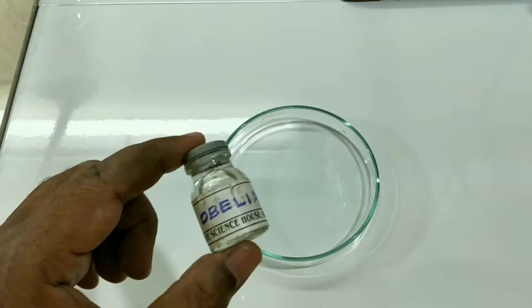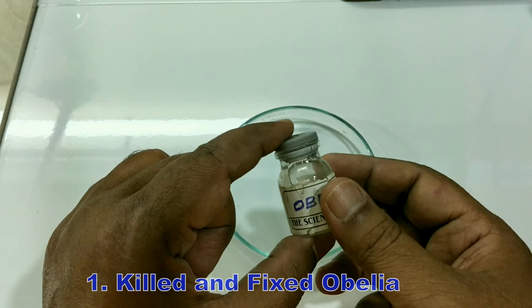The first step is killing and fixing. Killing and fixing means using certain chemicals like 0.1% osmic acid, ether, or formalin — all the life activities of the animal are suddenly stopped and further post-mortem changes are prevented. This is called killing and fixing.